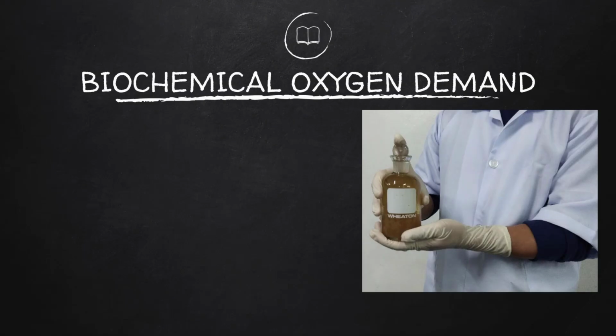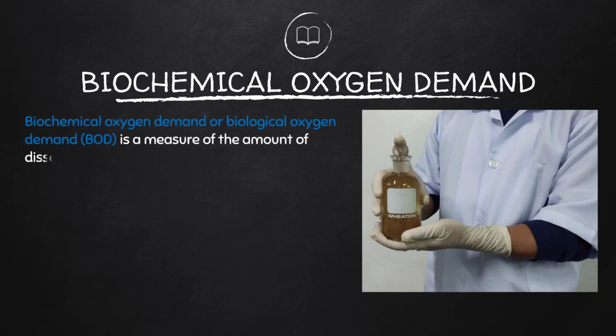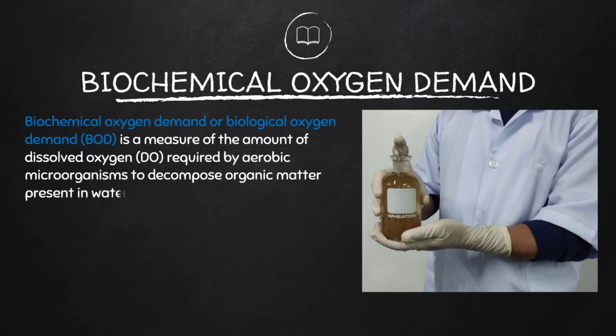Now, what is the biochemical oxygen demand? It is also called biological oxygen demand. It is a measure of the amount of dissolved oxygen required by aerobic microorganisms to decompose organic matter present in water at a certain temperature over a studied period.